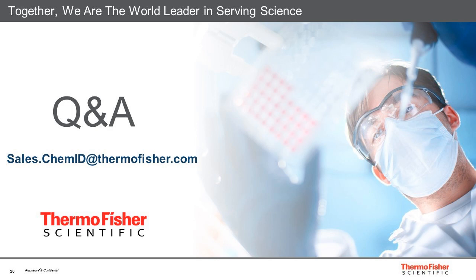Water, yes. So we reconstituted the media powder in high purity water. Okay, and can it be used to identify lot variability? Yes. It depends on the model that you make, but you can absolutely build models to track lot-to-lot variability. Understand lot-to-lot variability ideally is very low, which would be good, but you can track that with the tool.